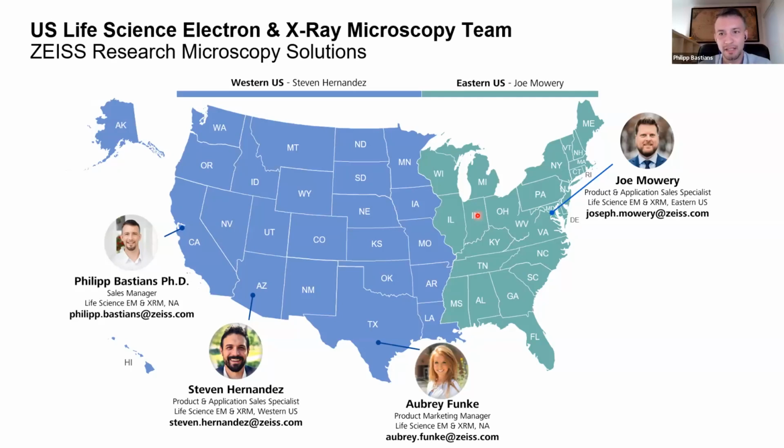So I'm really excited, and going forward, I hope Ruqing and Tom let one of us talk again down the road, showing you some of the micro-CT Context data which we use for these correlative experiments with array tomography, with cryo block-face SEM or FIB-SEM tomography.